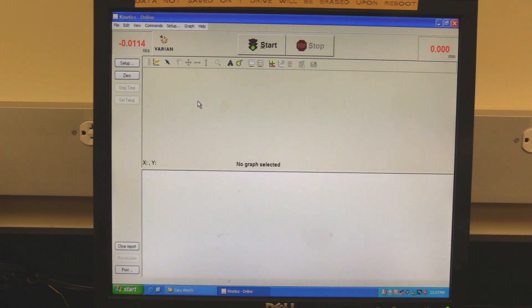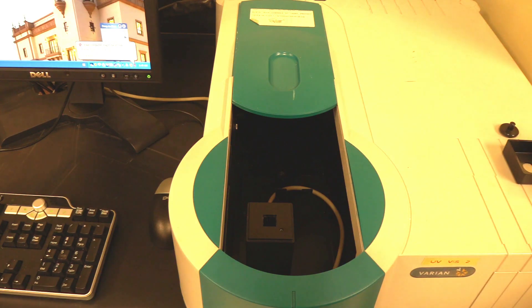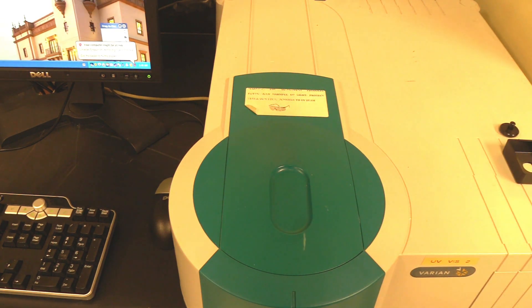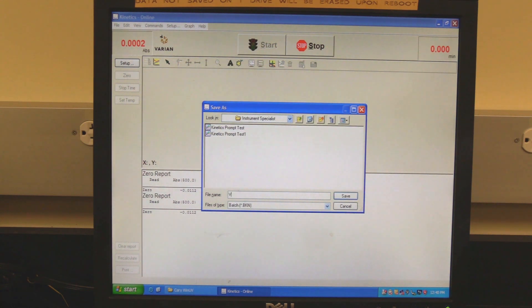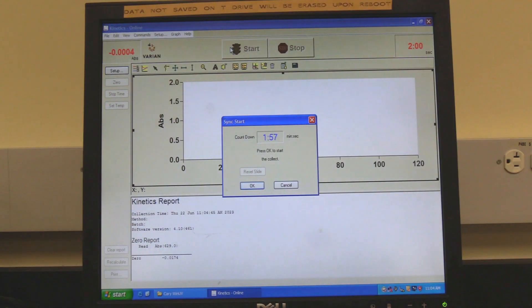Click on the zero button. When prompted, click on OK. In some cases, the instrument may need to be zeroed twice. Insert the sample cuvette in the sample chamber as demonstrated in wavelength scan measurement. Click on the start button. If save at start was selected, then the software will prompt the operator to save as shown in the video. Find the appropriate folder, name the file, and click on save. The software will prompt for the sample name. Click OK. The countdown timer will appear. Add the reaction reagents to the cuvette in the sample chamber and click OK.